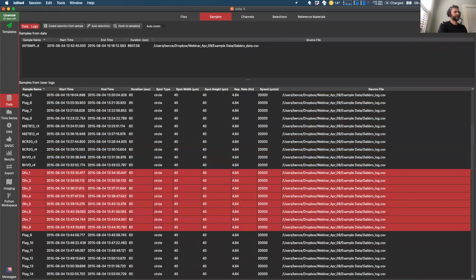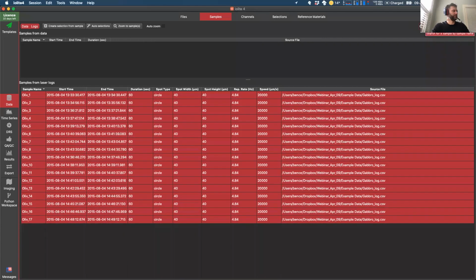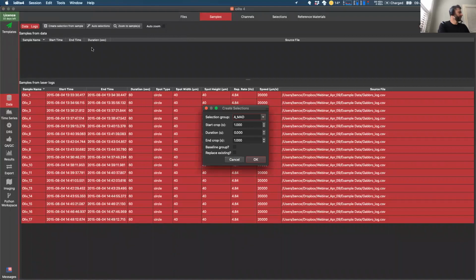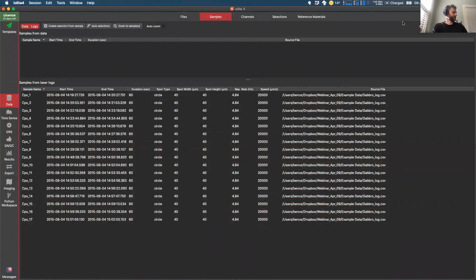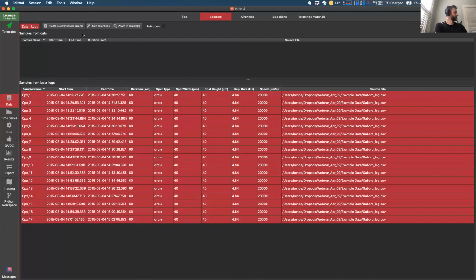Oh yeah, we've already got olivines. So let's create a new one. We're going to create a new selection from sample, and we're going to call this OL and CPX. And so we're going to add these olivines to it. Click OK. Then we're going to click our CPX. So select our CPX. Select all of those.